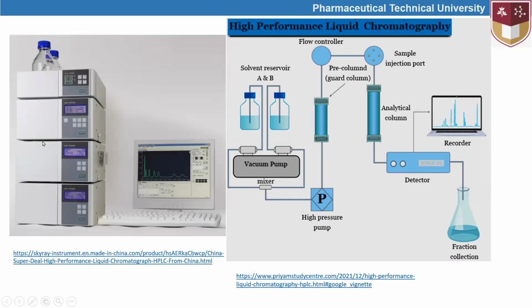Here we can see how the modern HPLC looks. It has these kinds of sections. The first one belongs to the pump, and then the injector, the column holding part, the degassing part, and other parts. Here, let's take a look at how it can work.